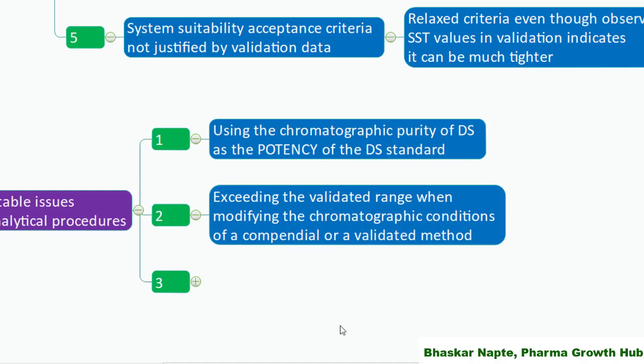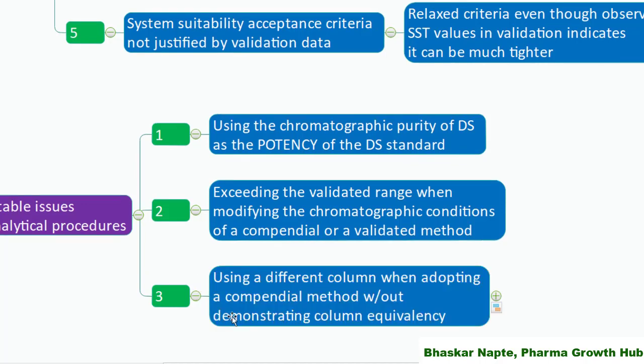Exceeding the validated range when modifying the chromatographic conditions of a compendial or validated method. You need to understand the boundary of your method's robust range — for example, the method is robust between pH ± 0.2 and organic solvent variations of ± 5%. You are allowed to make changes within these studied ranges, but if you start varying parameters beyond the proven robust range, this is not acceptable. If you need to exceed these ranges, do consider conducting a robustness study.